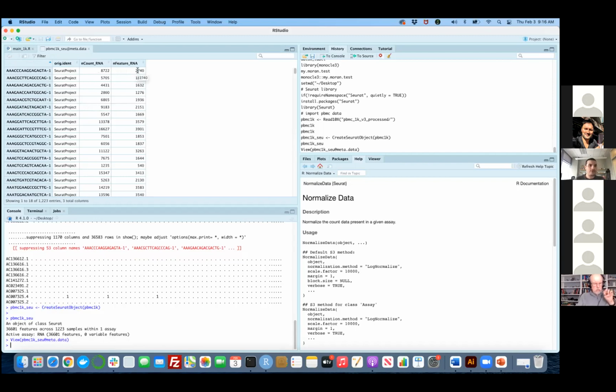You can use these measures directly as a quality control process, and we'll be able to look at each cell and its total number of UMIs in order to understand which of those cells we can remove.